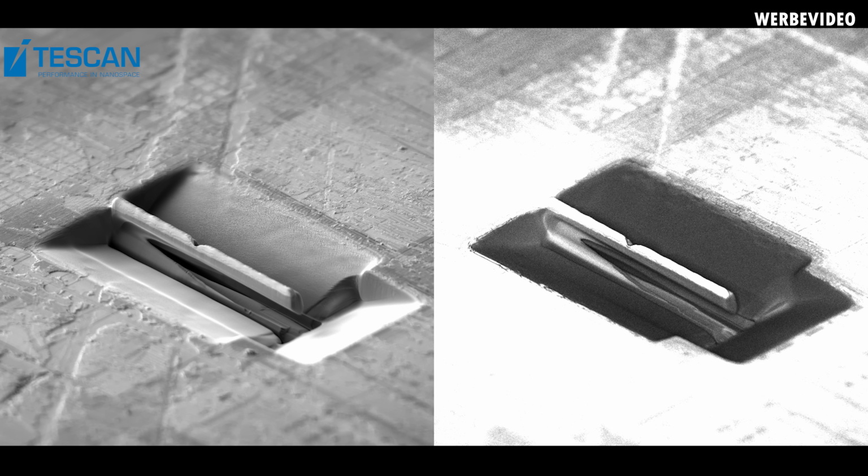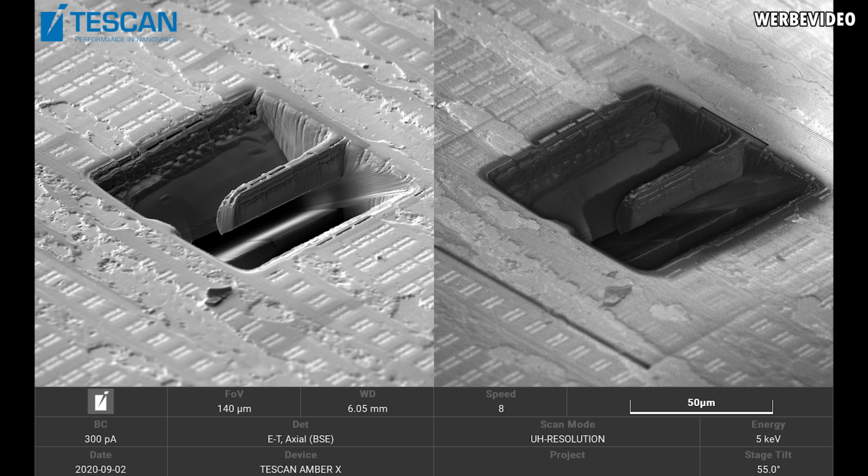At this point, the lamella has a size of only 100 micrometers length. That means the thing that you're seeing on the picture, which looks kind of tall, has only the length of 0.1 millimeter. If you would put this on your finger, it would just look like a tiny piece of dirt. As comparison, now we are seeing an image of the lamella of the 10900K.